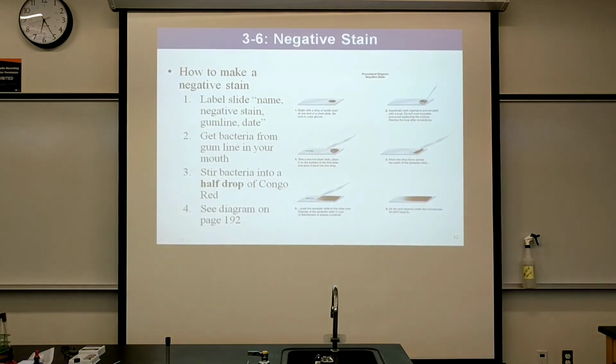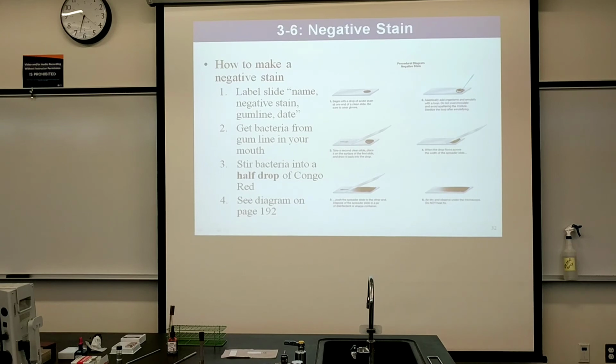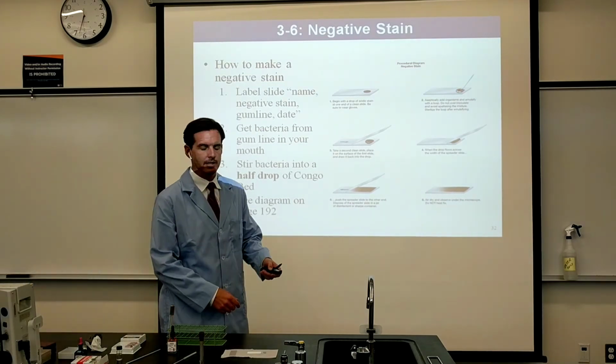Start back up here with a close-up of the negative staining procedure. So first I've done step one before we get to the close-up that you need to see. Step one was to label the slide negative stain.